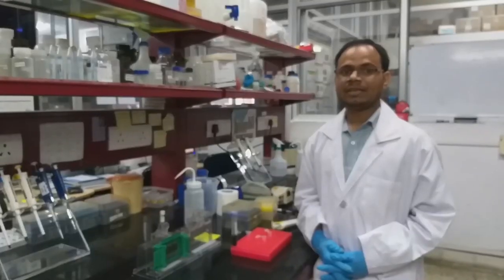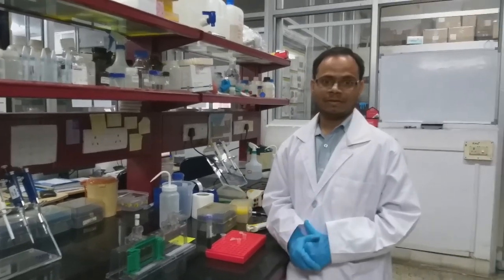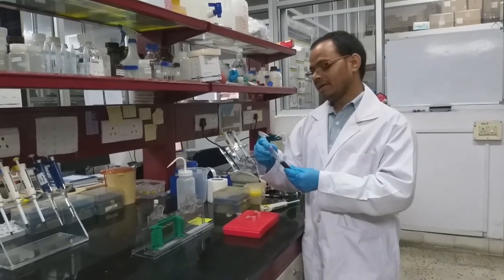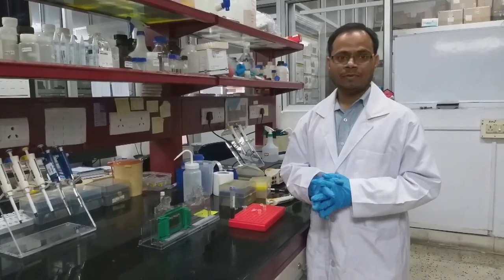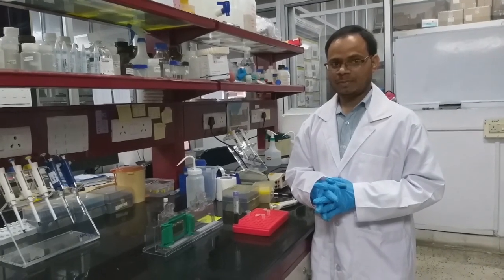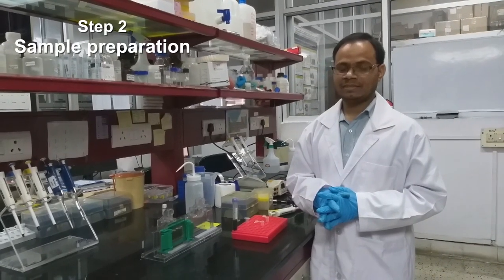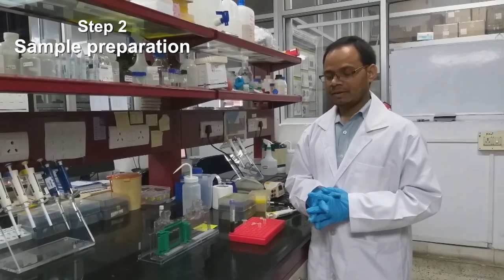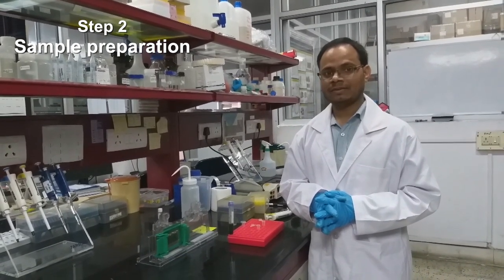will run the gel. While the stacking gel is solidifying, we have to prepare the sample for loading in the SDS-PAGE gel. For that we have to prepare loading dye, 10x or 6x. It mainly contains 250 millimolar Tris pH 6.8, 30% glycerol, 10% SDS and 0.05% bromophenol blue. So here we can add 10 millimolar DTT also as a reducing agent.